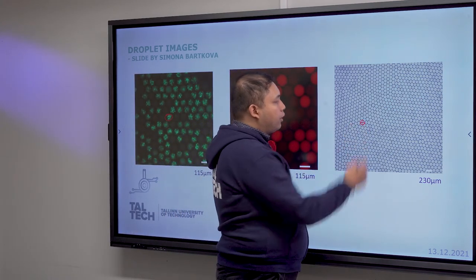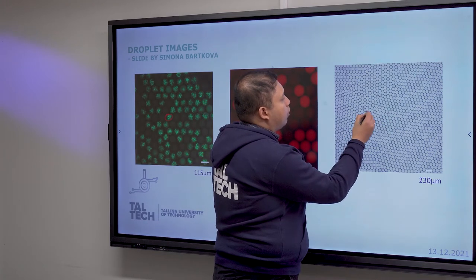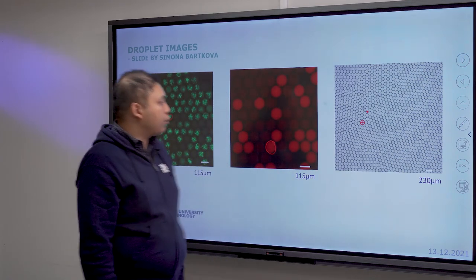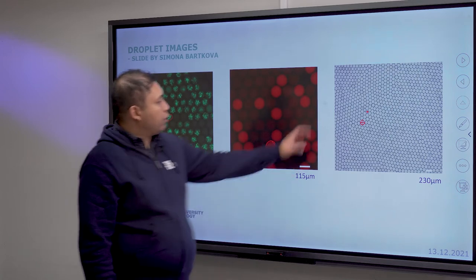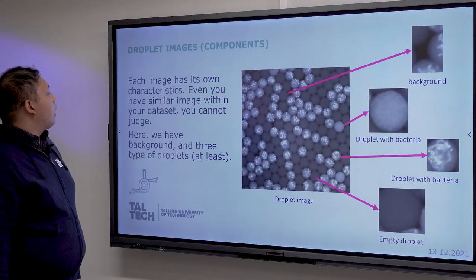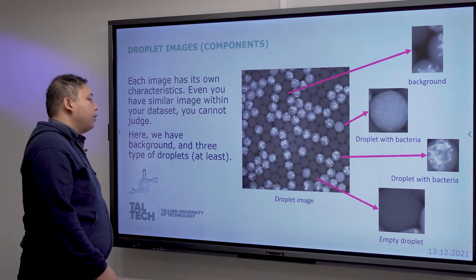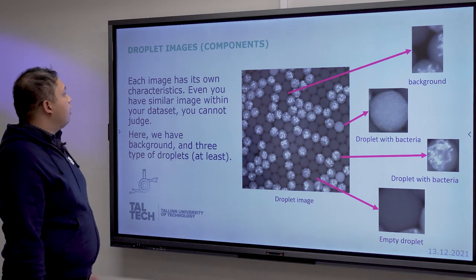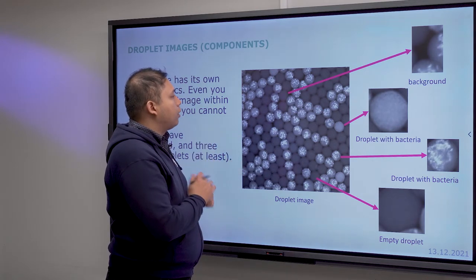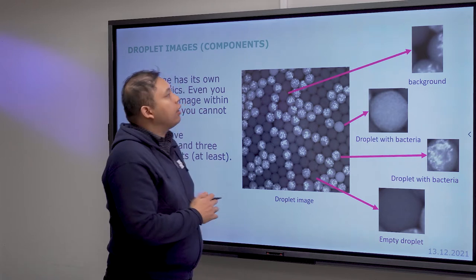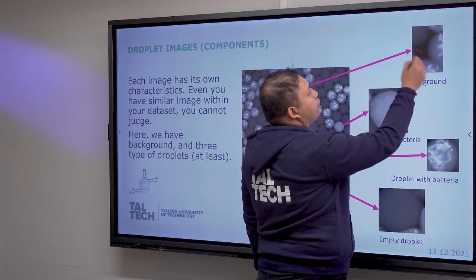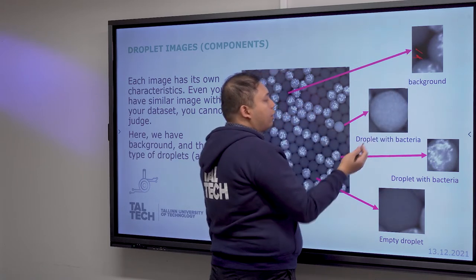In bright field, you can't easily see it, but if you zoom in there is a dark dot inside the droplets, and some droplets are without objects or bacteria. Regarding the droplet images, you can distinguish them with your own eyes, but we also need to look at the data itself. The key components are: background, droplet with bacteria, and empty droplets.